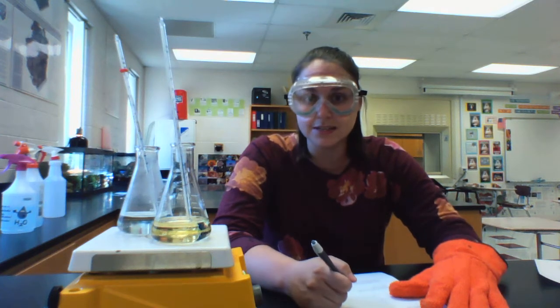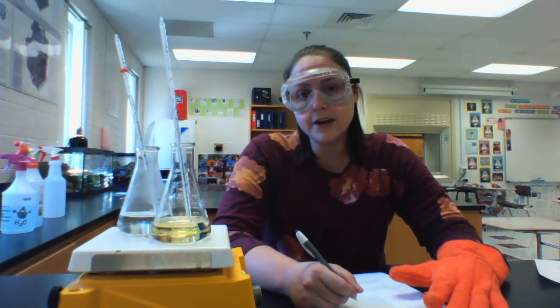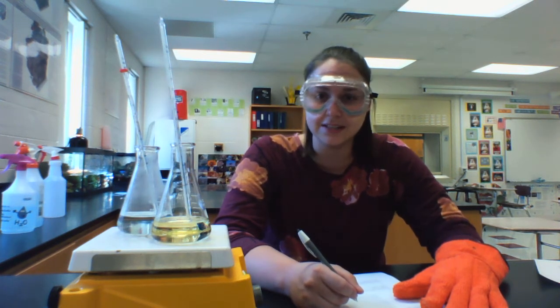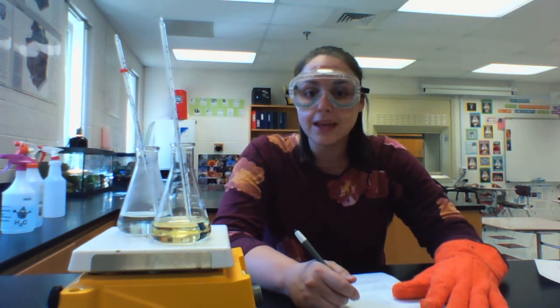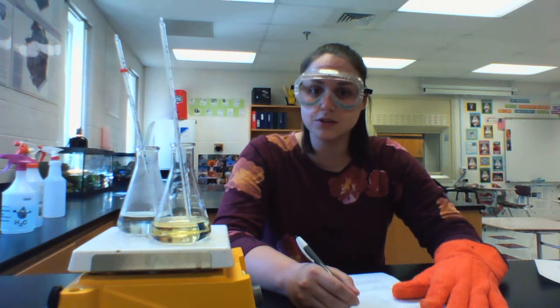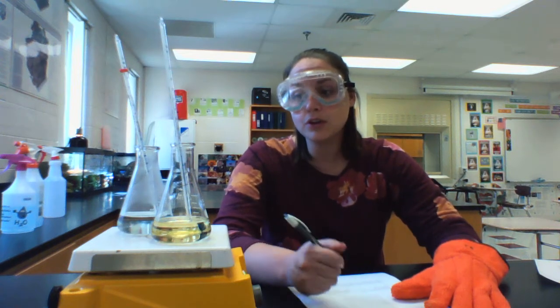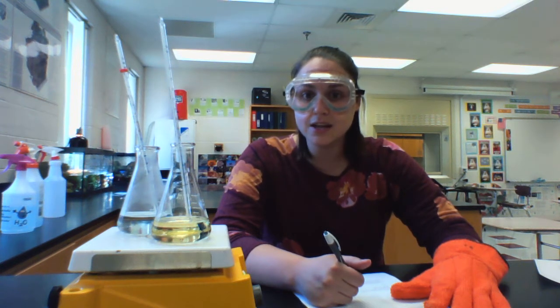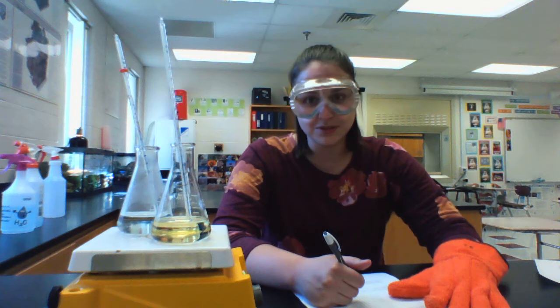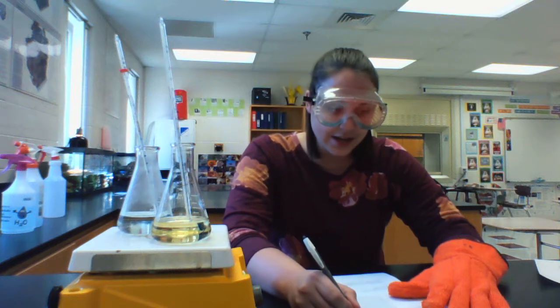I'm measuring in Celsius because we're in science class, and in science classes, we measure in the metric units. Fahrenheit is a customary unit that's used in the United States and a couple other countries, but Celsius is used throughout the world and used by scientists, even here in the United States. So whenever we do any sort of labs related to temperature, we're going to use the unit Celsius. Something else you might have noticed is that we are using Erlenmeyer flasks that are measured in milliliters, which is also a metric unit used by scientists all around the world. We've got about 8 seconds left till we do our next reading.